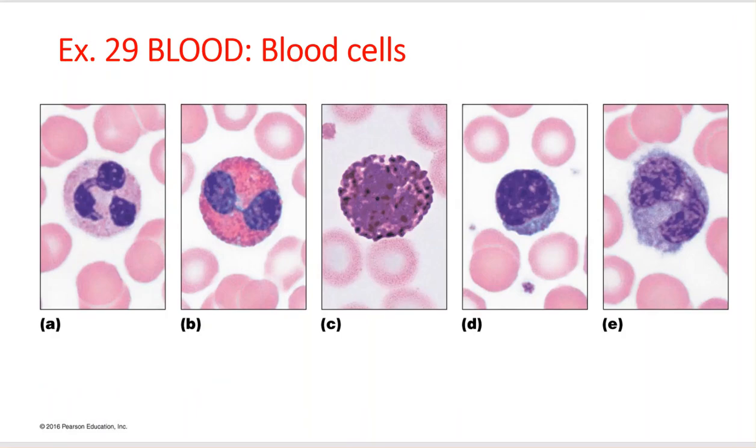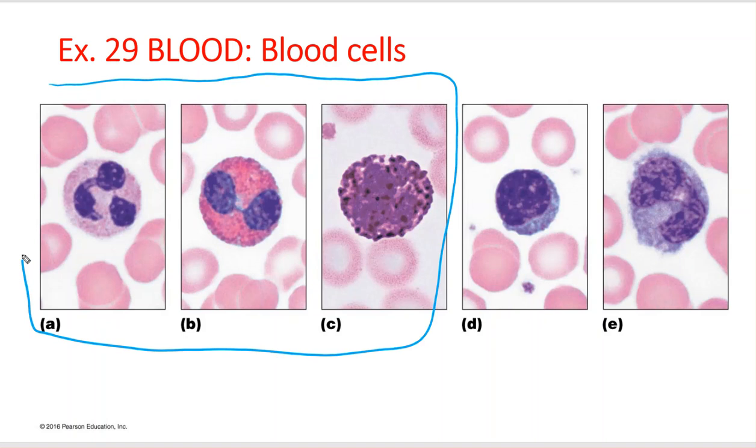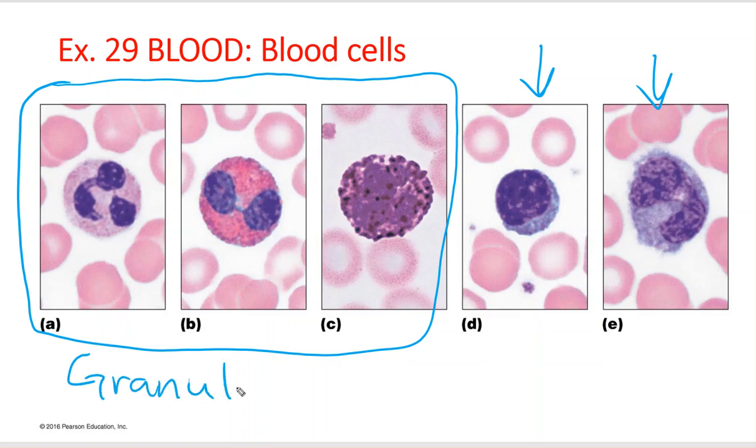I'm going to go through each type of white blood cell for you that you'll be looking at on histologyguide.com and identifying cells. They do a great job of pointing them out to you. First thing I want to point out is that these three look a little bit different than the other two. These three that I first circled are granular, and that means that they have vesicles of product, a hormone or an enzyme, that they carry to their cell membrane and release at an injury site.